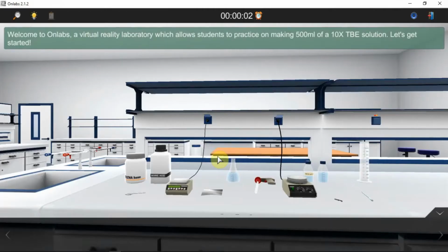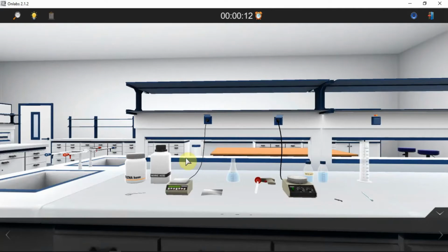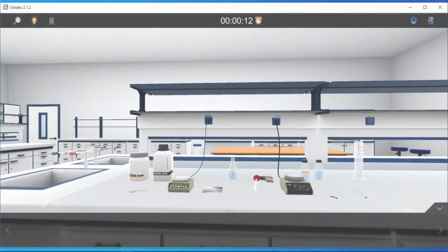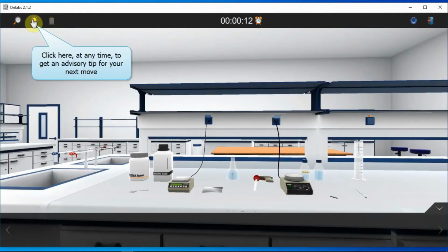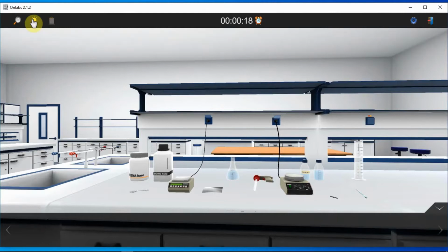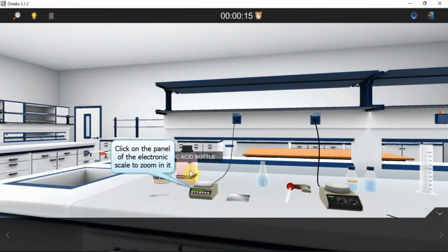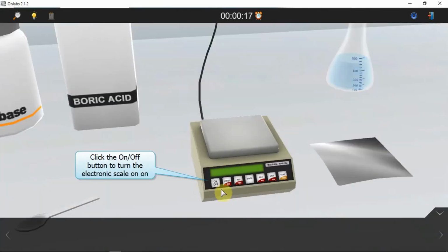Welcome to Onlabs, a virtual reality laboratory which allows students to practice making 500 ml of a 10 times TBE solution. Let's get started. You can always get an advisory tip by left-clicking the tips icon that is placed in the toolbar. Press the on-off button on the left side of the scale panel. Turn on the electronic scale.